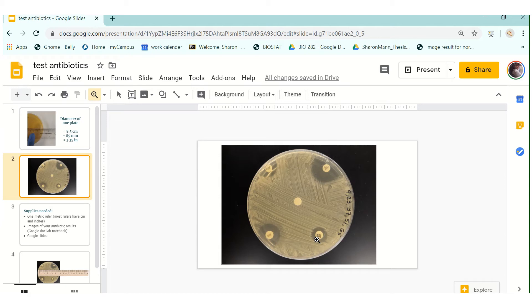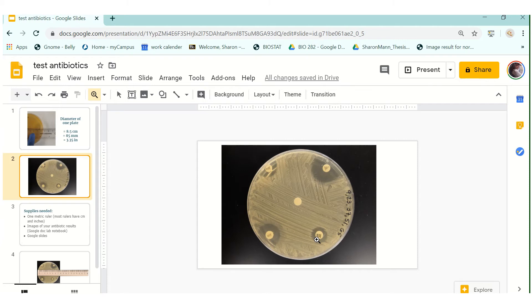So we need to record the actual size of the zone of inhibition and then we will refer to our lab manual in our antibiotic chapter where it will actually tell us whether or not that antibiotic was effective at inhibiting the growth of the bacteria based on whether or not the bacteria was resistant, sensitive, or had an intermediate effect.